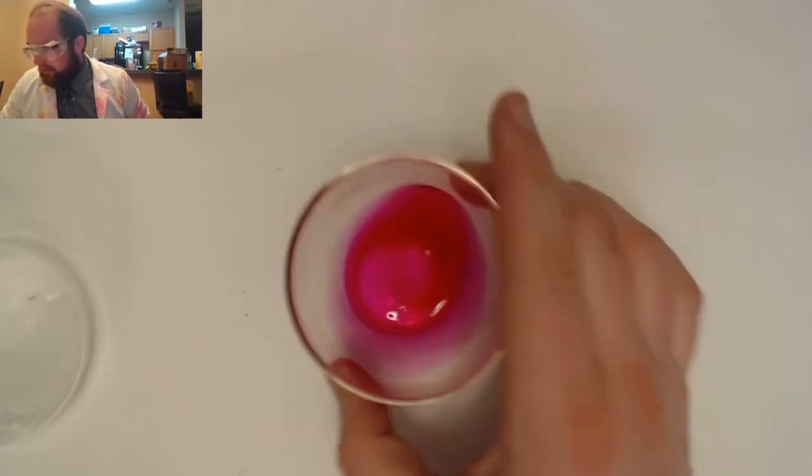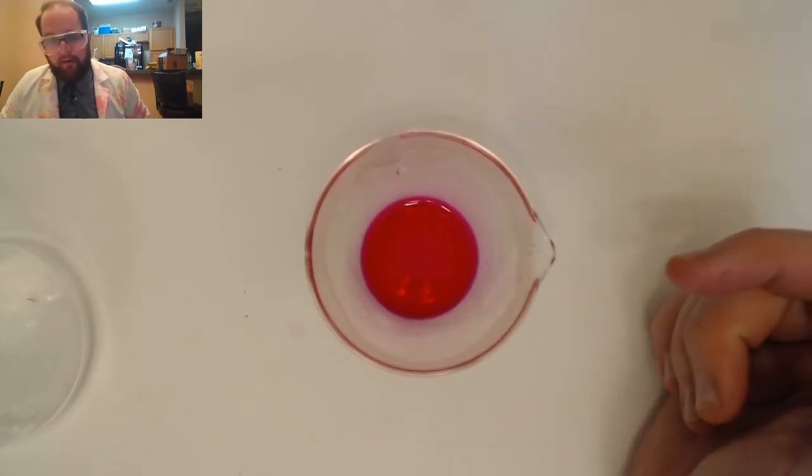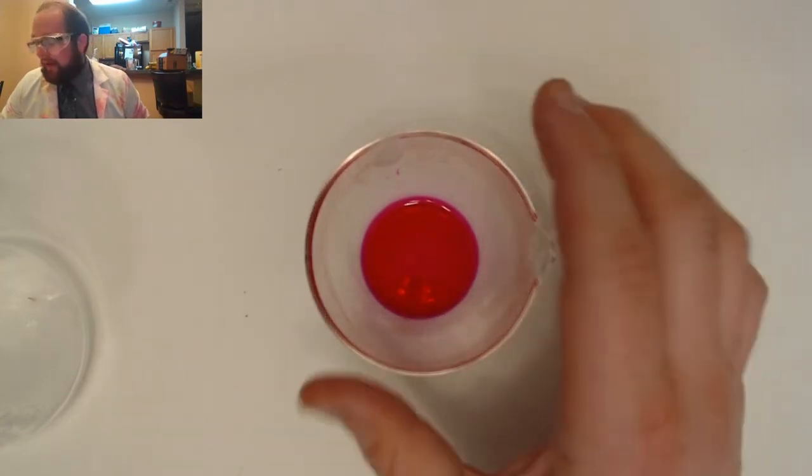I'm not getting it super great here. How do I know that? Well, because I'm getting a very dark pink. This tells me that there is way more base than there is acid.